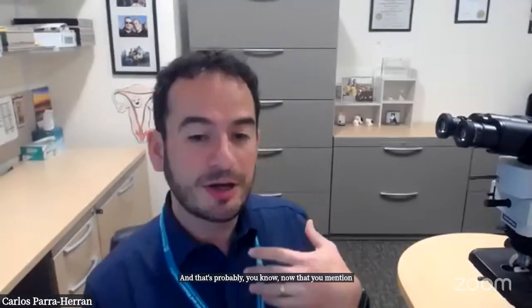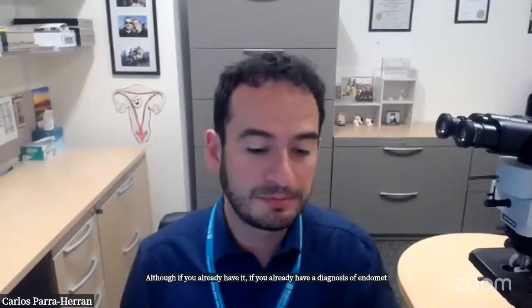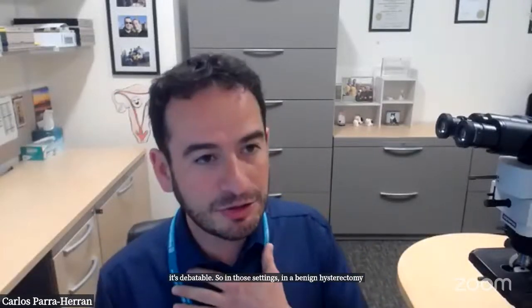I guess you risk missing the possibility of detecting endometriosis, and now that you mention it, that's probably an approach I will take if the patient has such a diagnosis, or if I encounter endometriosis in the initial sections, I may be compelled to go back. Although, if you already have a diagnosis of endometriosis, the point of chasing after it in the parametrial tissue is debatable. So in a benign hysterectomy, in my institution, we don't go after that. Do you? No, we don't take parametrial shaves.